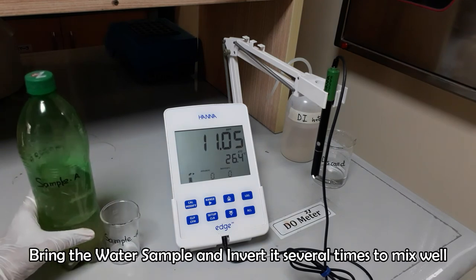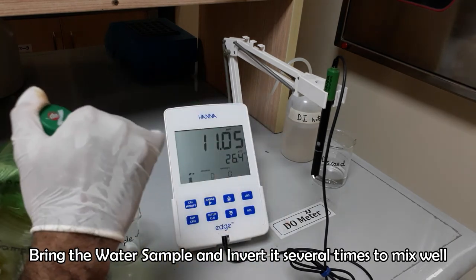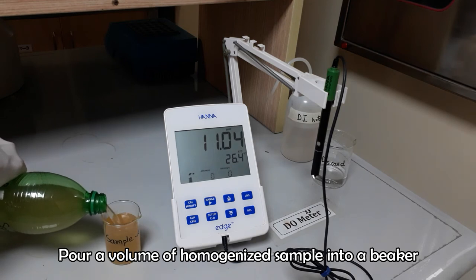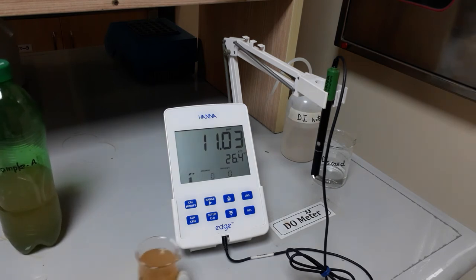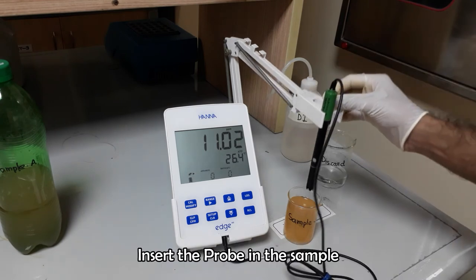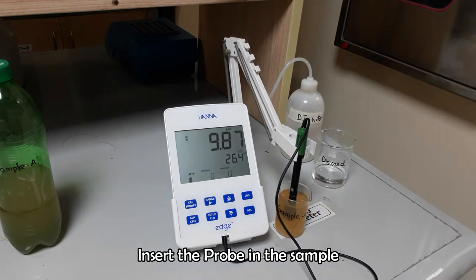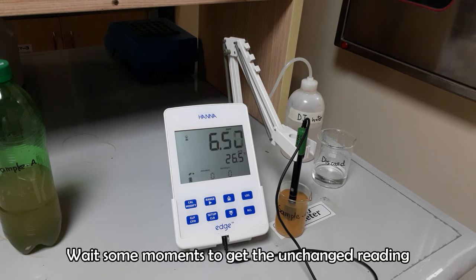Bring the water sample and invert it several times to mix well. Pour some sample into a glass beaker for testing. Now insert the probe in the sample and wait until a constant and unchanged reading is given. Taking reading at room temperature is compulsory to get the accurate DO result, because if the temperature fluctuates then the result will be changed.